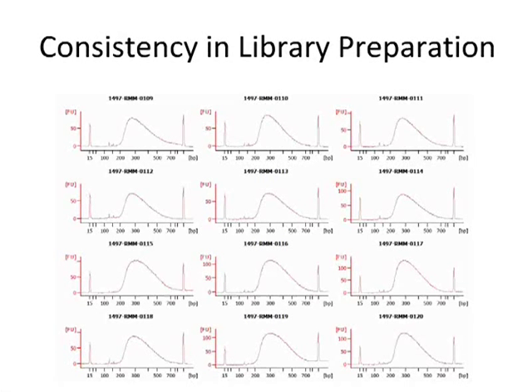So consistency in library preparation is shown here. This was done on the robot deck. In this particular example it's an Agilent Bioanalyzer. We've subsequently changed all of this to the Caliper instrument, just for improvements in throughput and cost per sample, but the results are essentially indistinguishable.